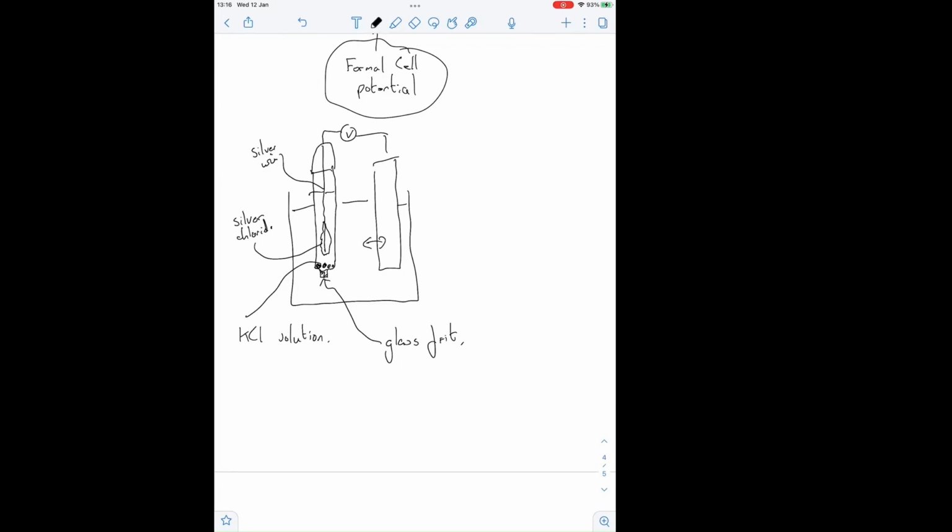Take the potassium chloride, and I'm going to be doing, I don't know, an experiment in DMF. So you spent hours drying your DMF, and then you put a reference electrode in, and you take a calomel reference electrode. So now your DMF is wet, because the water is going to just leak through into your DMF. So the other message with reference electrodes: choose the correct reference electrode for the experiment you're doing.